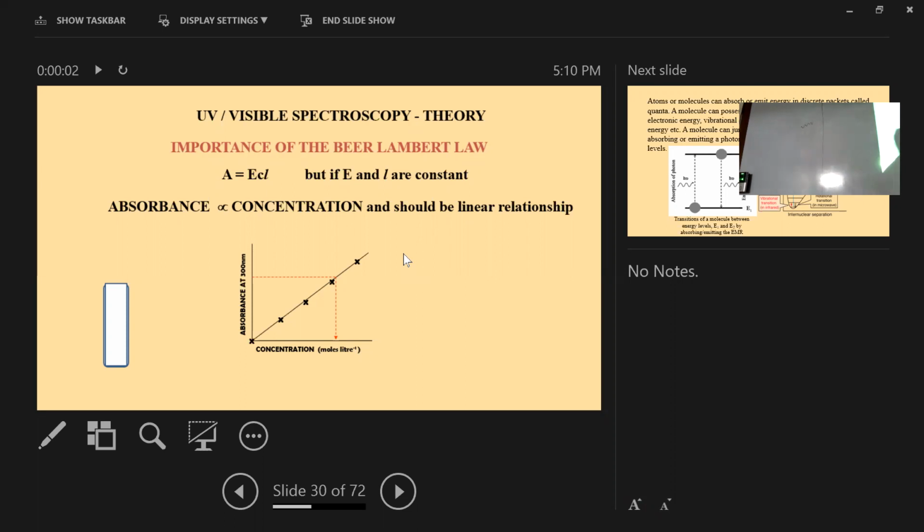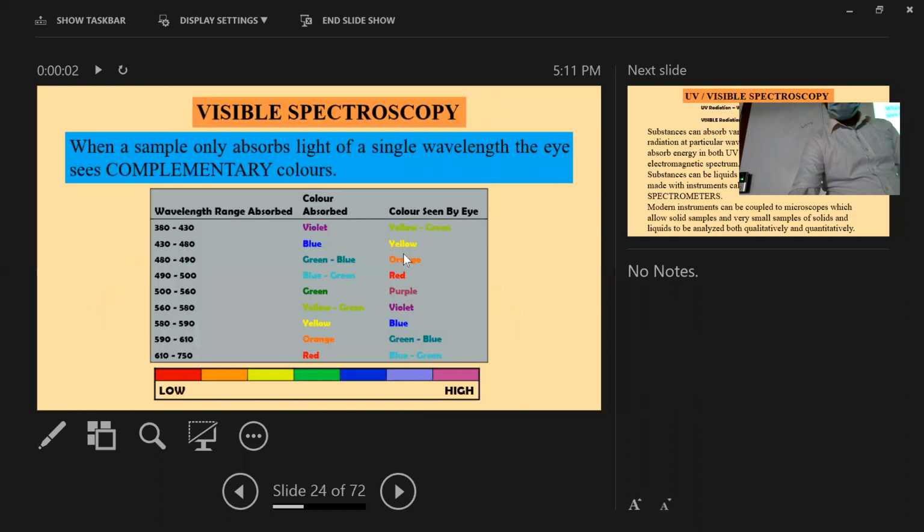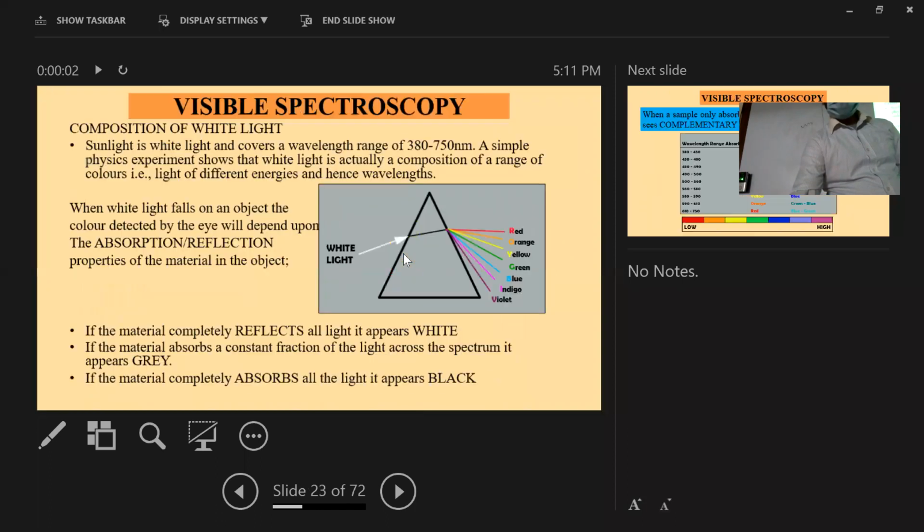Sometimes it may be difficult to find the concentration because you have a standard curve in this range. That means what I have shown is only this range, 0.01 to 0.1 molar. But your sample may have very high concentration. In that case, our instrument has some limitation. What is the limitation? I have mentioned it as a deviation. Maybe later I will discuss it a little bit.